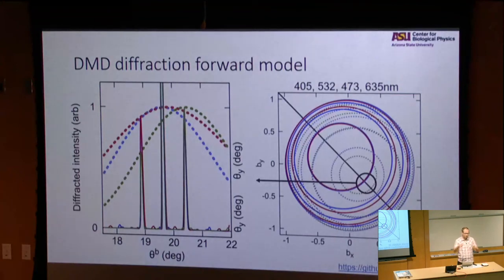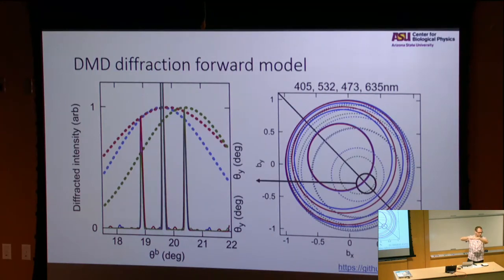This goes back to your introductory point, right? If we interfere these two waves and the intensities are not quite balanced, we'll come up off the floor a little bit. So we do come up off the floor for the green slightly. But it's acceptable for where the reconstruction algorithm works. If we could find a sufficiently powerful 557 nm multimode laser that we can use, then that would exactly match the conditions. But for the 532 that we have, this is what we're living with at the moment.